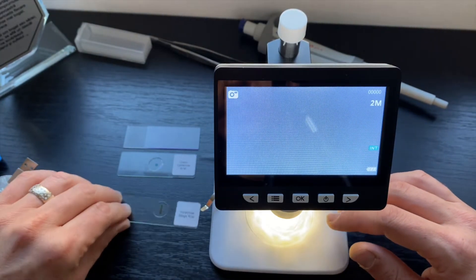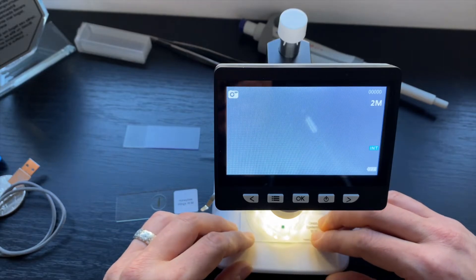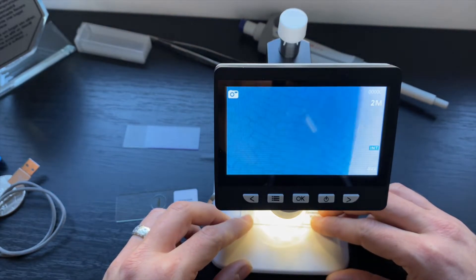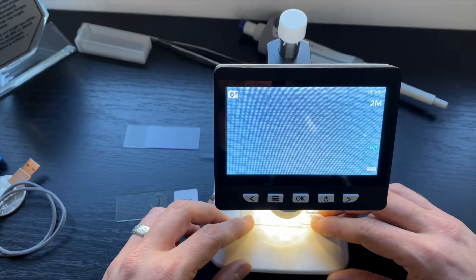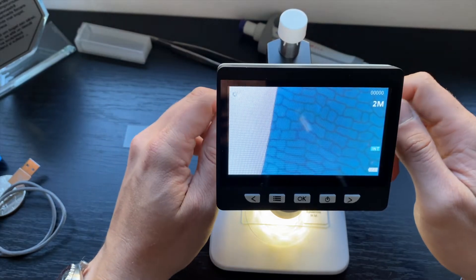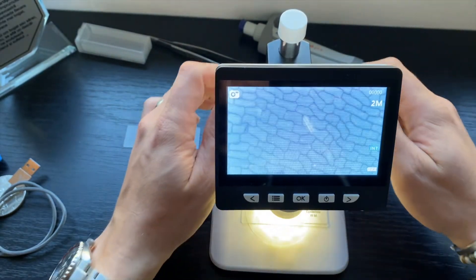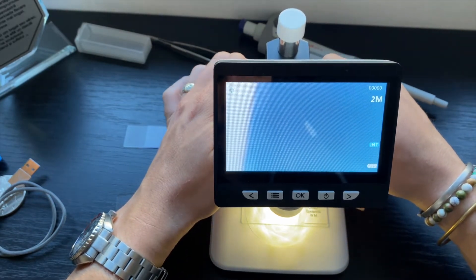Let's also try with the other sample — the onion epidermis. We're just going to put it straight under the microscope and see what we can visualize. This is the onion epidermis. Let's see if we can zoom in a bit further. And of course I'm going to attach some pictures.